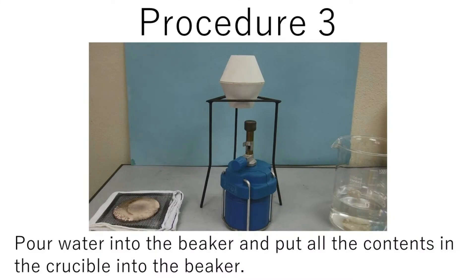Procedure 3: Pour water into the beaker and put all the contents of the crucible into the beaker.